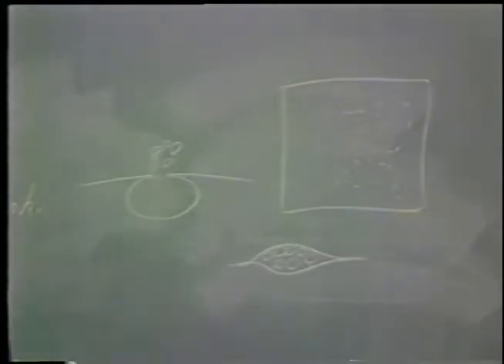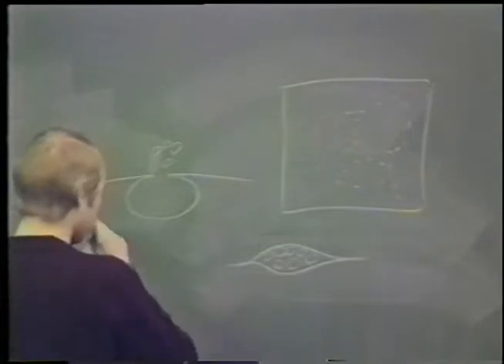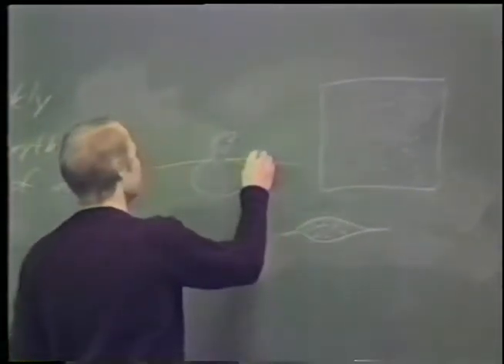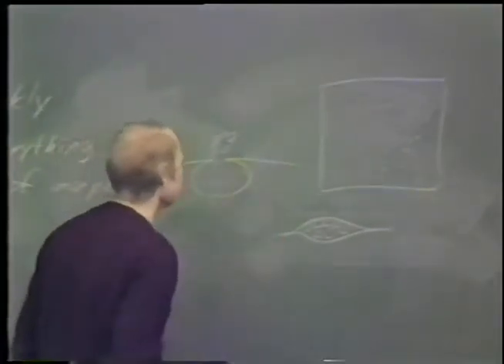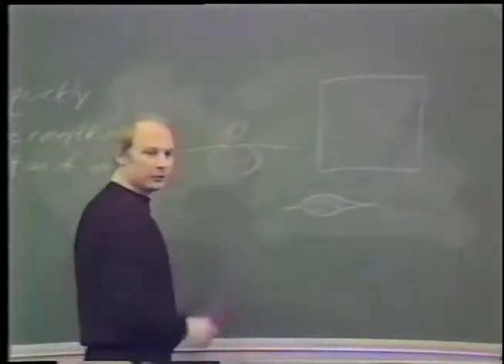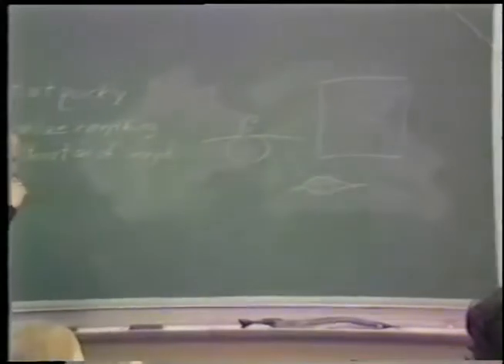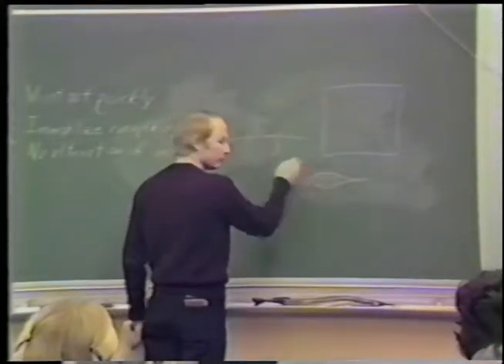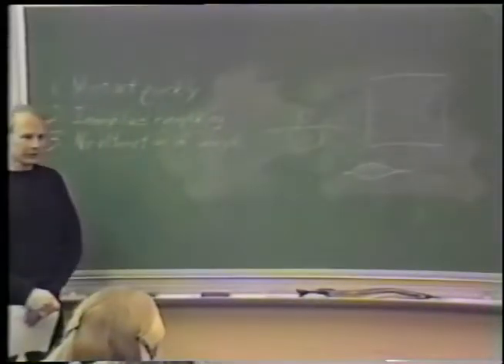Okay? Now, all of these effects are probably related to the fact that lipases in the membranes, when they're fixed, are still active. Now, glutaraldehyde can't fix lipids, so here are these lipases in the presence of unfixed lipids churning away, generating lysophospholipids, etc. And it's thought that this is what's giving rise to all these various artifacts.